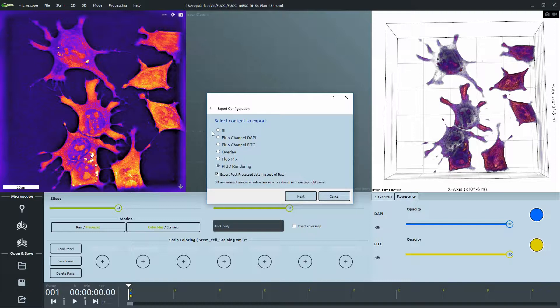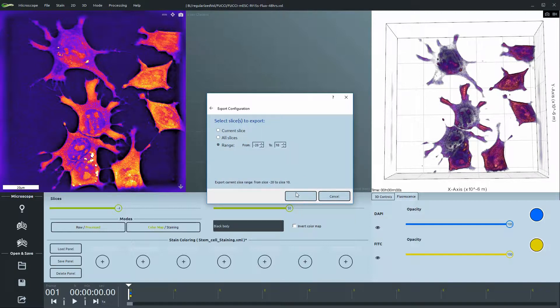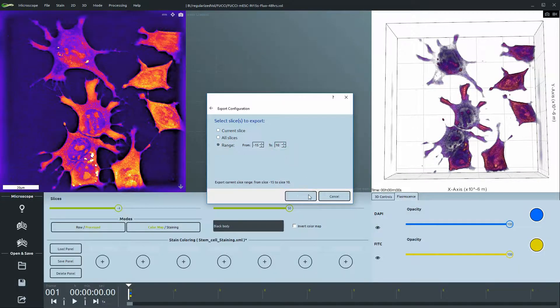If you selected the refractive index or an overlay, you can then proceed by choosing which slices you would like to export. You can see the numbers on the slider — either export the current one, all of them, or a range.